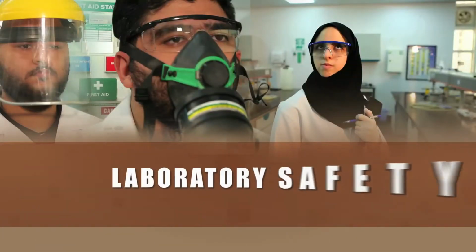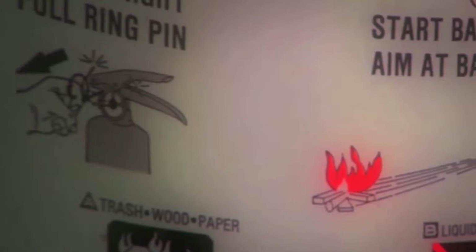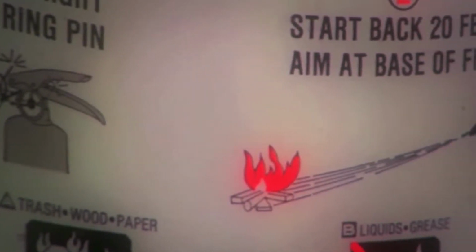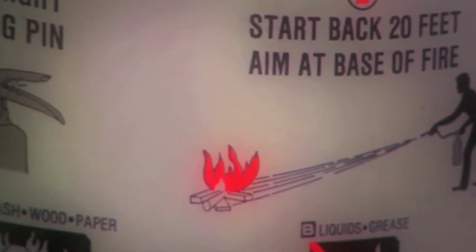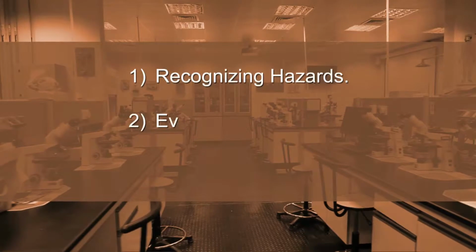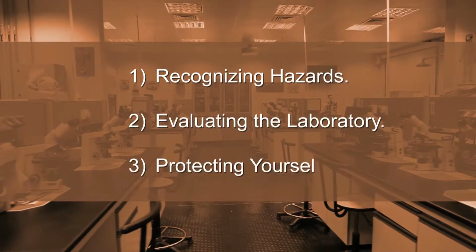Today, we will discuss fire safety in the laboratory. The complexity of laboratory activities requires knowledge and constant vigilance, especially when it comes to fire and life safety. This video will identify 3 critical components to fire and life safety readiness for the laboratory: recognizing hazards, evaluating laboratory, and protecting yourself.